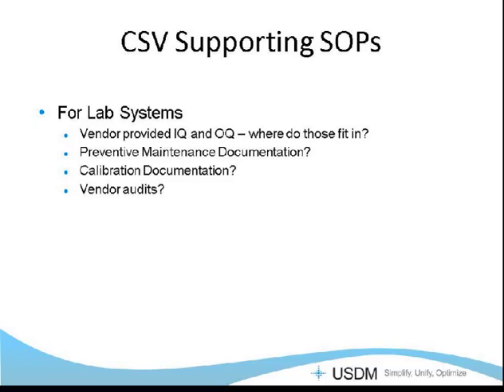So the vendor packages that are left to you in the laboratory are very valuable. You still have a complete validation package, but a lot of the requirements that you create can be met by the vendor documentation, and that allows you to focus your efforts for laboratory system qualification to the way that it's going to meet your use, to testing your own user requirements, rather than testing out-of-the-box functionality, rather than testing the calculations. You can really limit the amount of testing that you do and make it far more efficient.